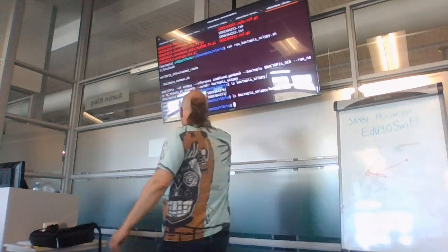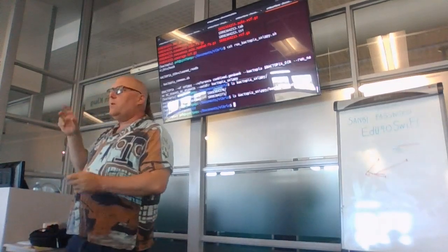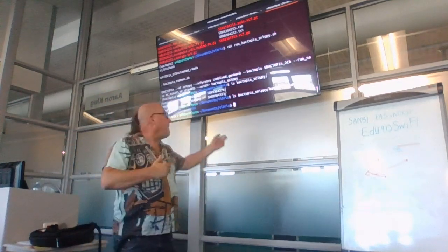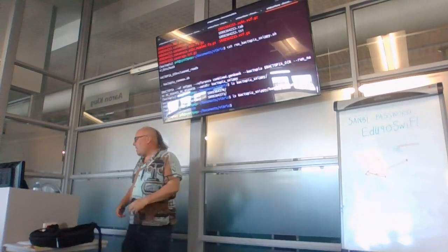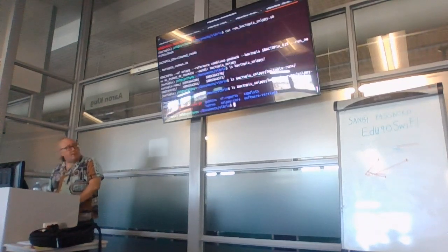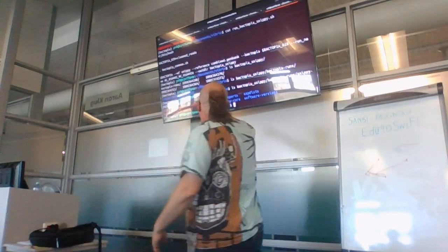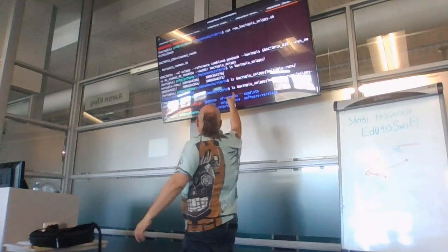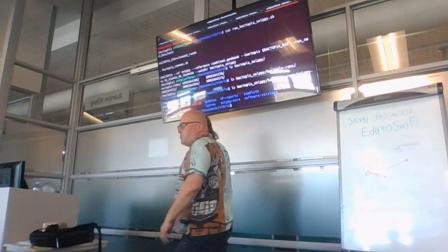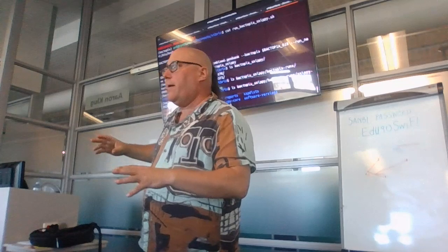But you must pay attention to the date and time of the run. I wish there was a way to just choose the name for this directory. Maybe there is, I just don't know it, okay? But this is the combined output directory. If we look inside of it, then we see the steps that I mentioned that get run for all of the samples. So there's the Nextflow reports, but there's Gubbins, Snippy core, snp-dists, and IQ-TREE. And so that's where all of our outputs from those tools are ending up, okay?